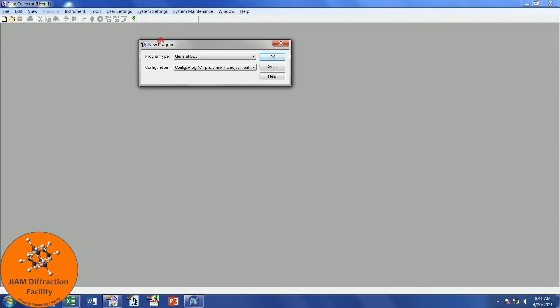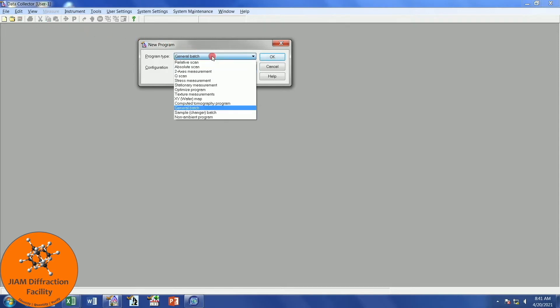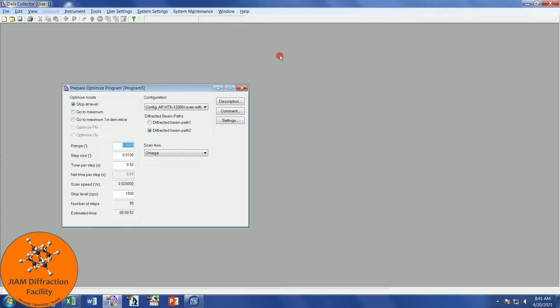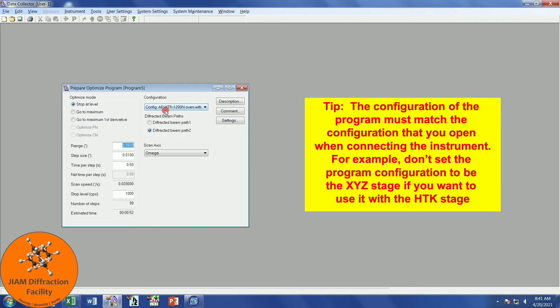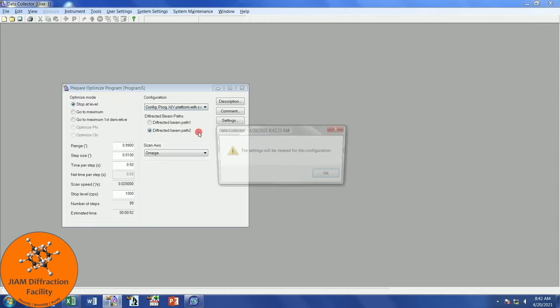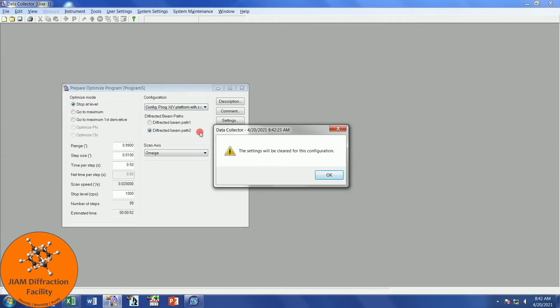We want to make sure that it is an optimized program. First, I want to check here in Configuration to make sure that these are correct. I see that my program defaults to the HTK-1200N stage, that's our high-temperature in-situ stage. For the purposes of this video, let's pretend that I wanted to create this program for the XY platform with Z adjustment, our XYZ stage. So I will choose this one for this example. It says that these settings will be cleared for this configuration, which is fine because we haven't made any settings.